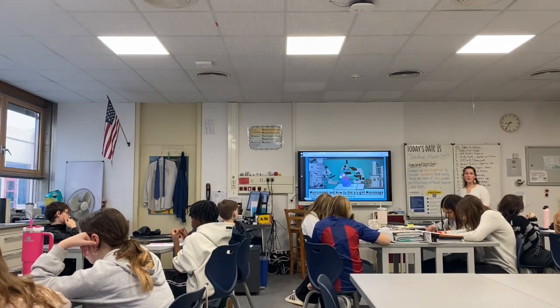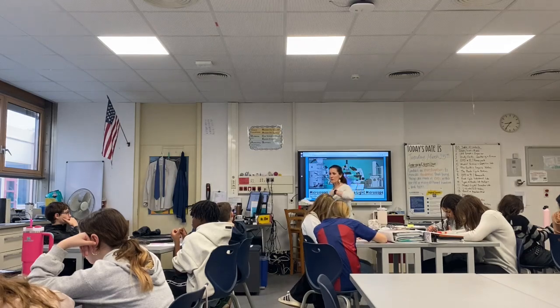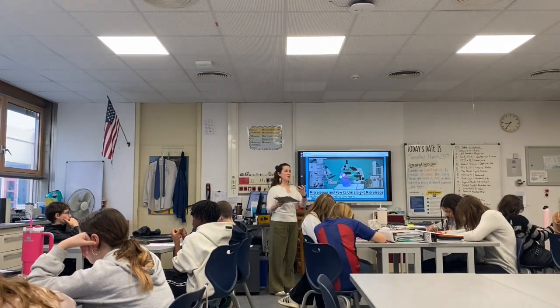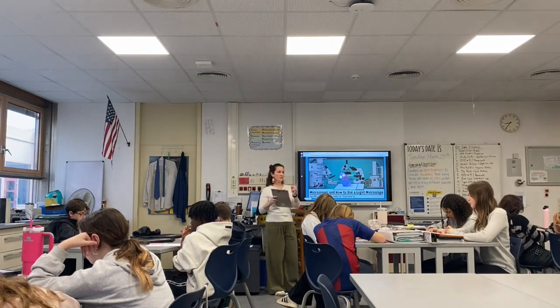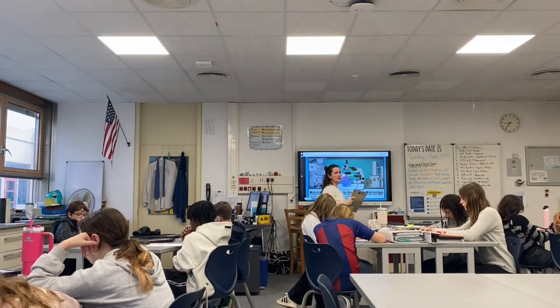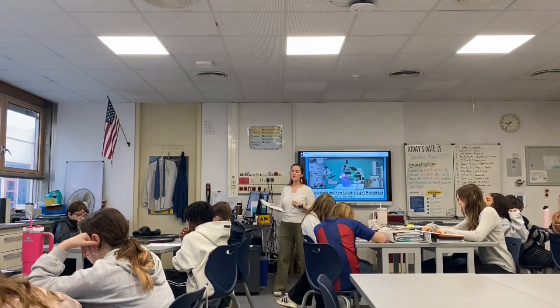Okay, yeah, first of all, because the scanning objective lens is going to give you the whole picture, right? Because as we said, as you go closer and closer, as you magnify it, you see less of the surface area of your specimen. So yeah, you want to be able to start there so you can focus it.